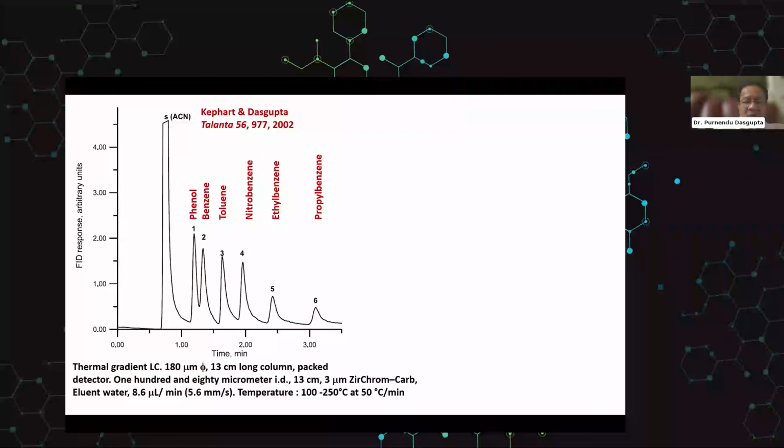So to keep water in the liquid phase, there's a lot of back pressure being applied. And under those conditions, everything is exiting as a gas. You can use standard GC detectors. These actually use a FID to do liquid chromatography. But it's very difficult.